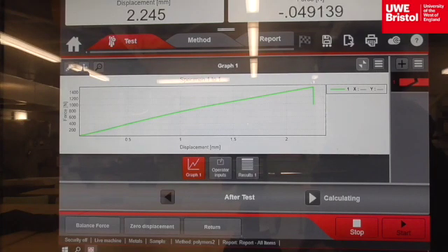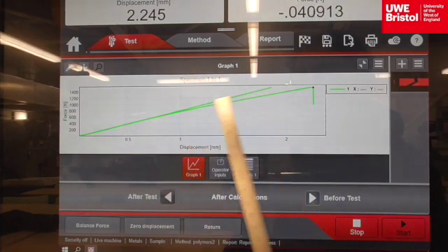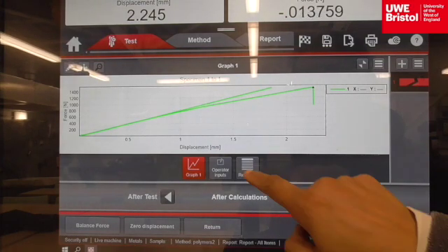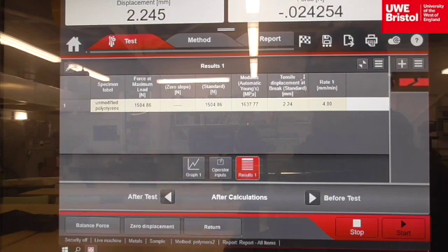The screen shows the plot of force against displacement, and selecting Calculating will display maximum force at the black triangle icon, and the corresponding parallel line along the plot is the line of modulus. Then tap on the Result tab, and the maximum load figure is displayed of 1504.86 newtons. That will be the Fmax used in the tensile strength calculation of force over cross-sectional area.